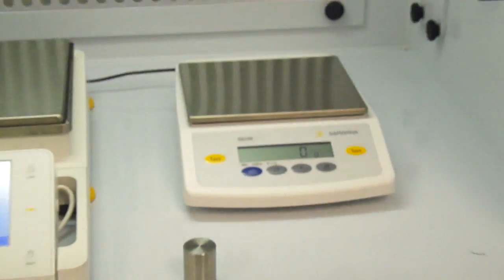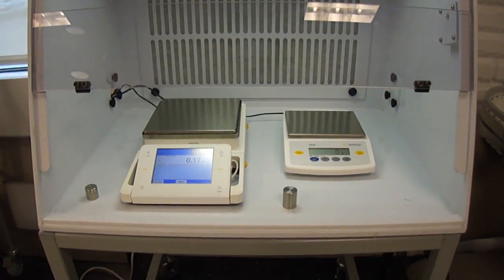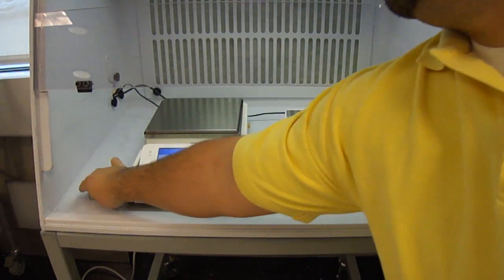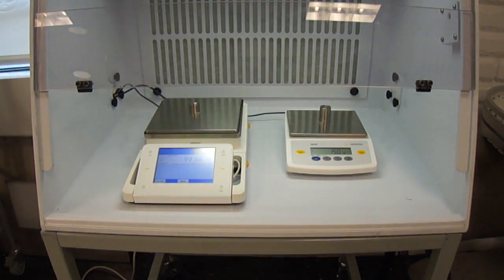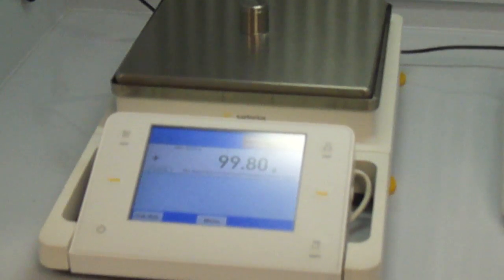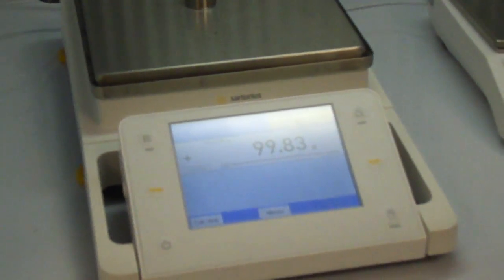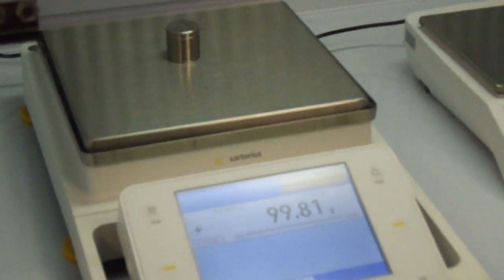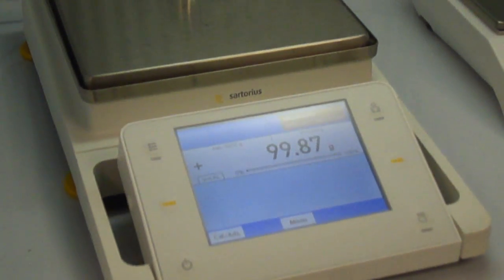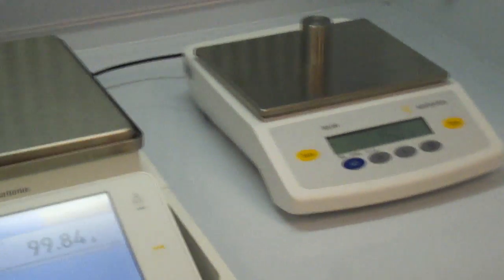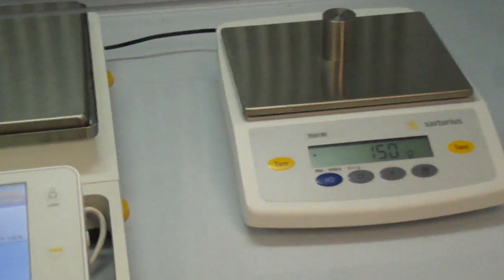And now what I'm going to do is put some weights on there and see if it will make a difference. So as you can see the Cubis is still fluctuating a little bit. I have a glare. And that's with 100 grams on there. And then you have 150 grams. Pretty solid. TE series.